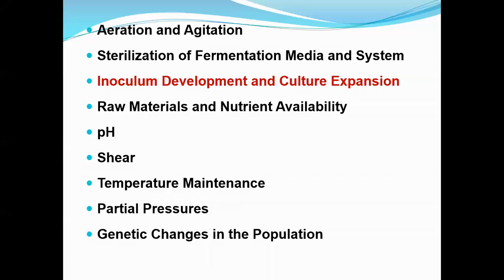Hello, dear students. So here I'm continuing my session on the scale up of the fermentation process. So the next step is inoculum development and culture expansion. So let us start.